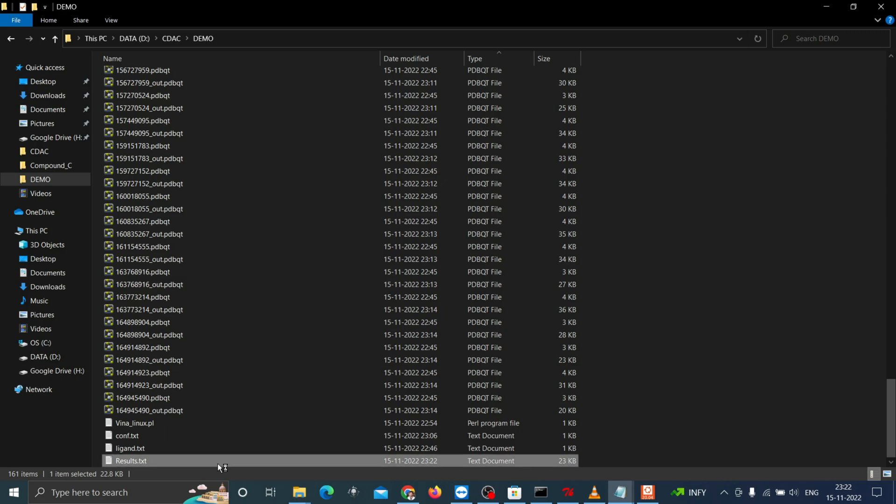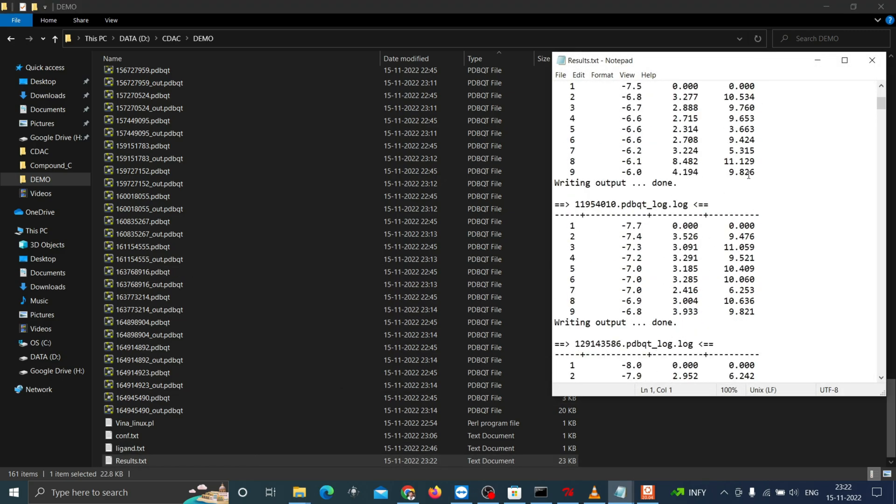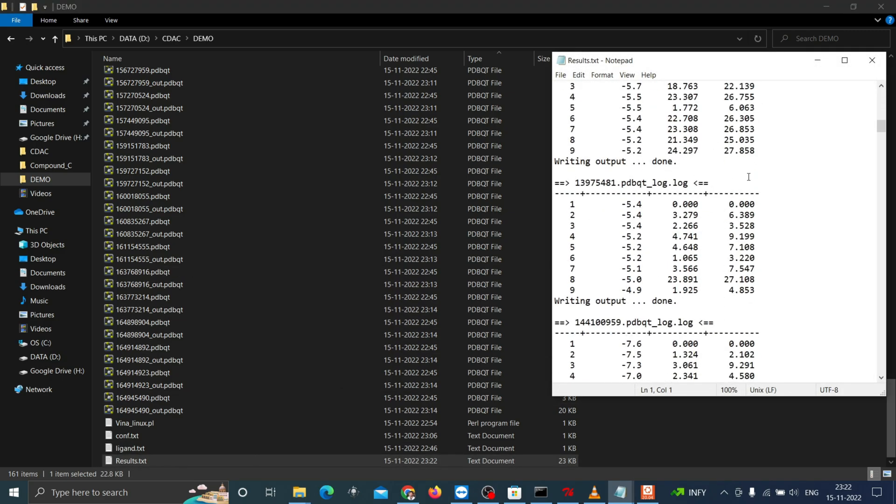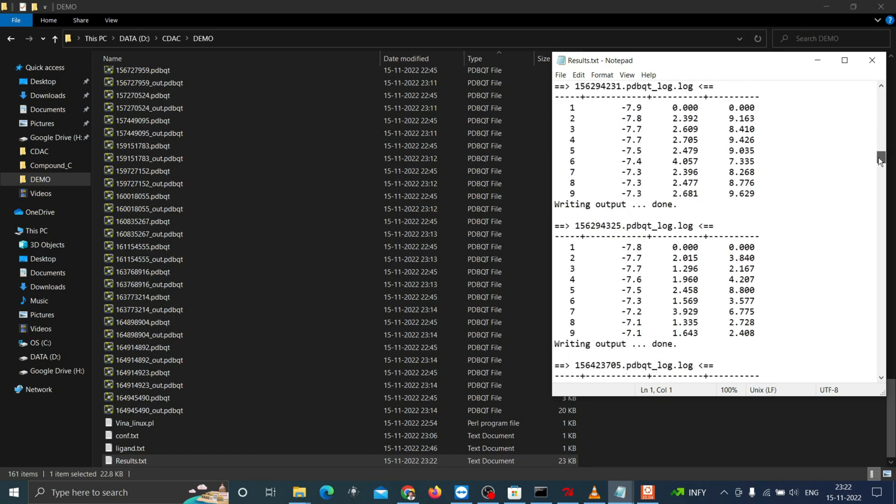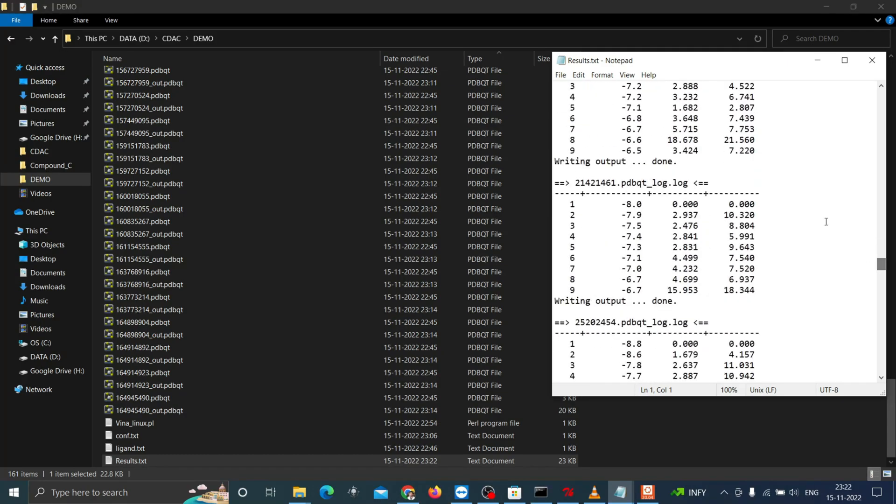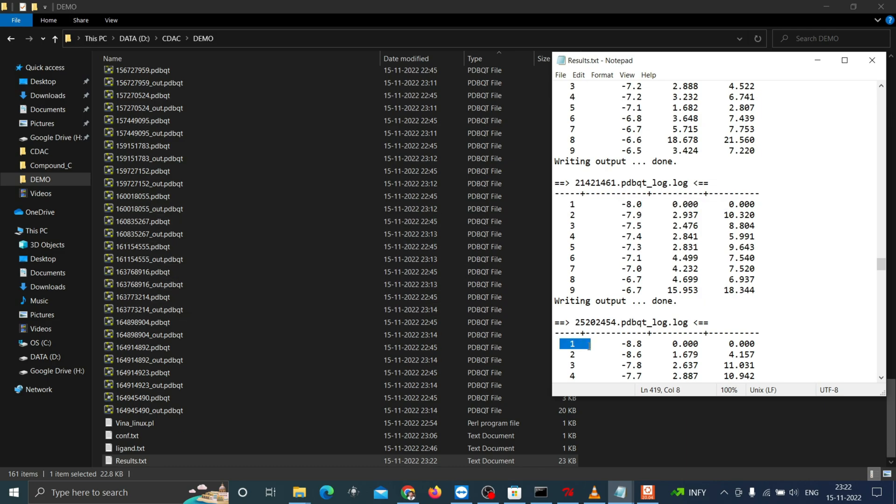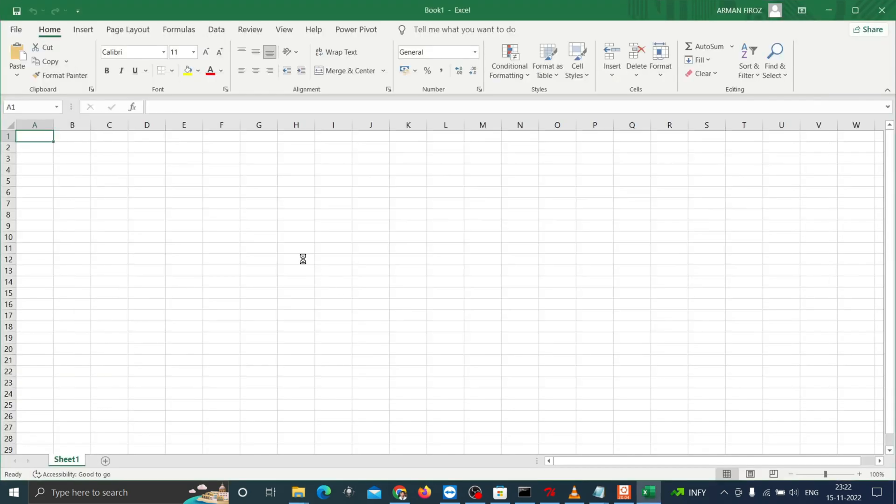Now you can see the results.txt file has been generated with all the results with the header as the file name. From this we'll be choosing only the coordinates of first result that is with zero RMSD. Let's see how it can be done.